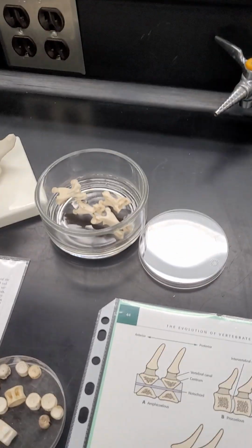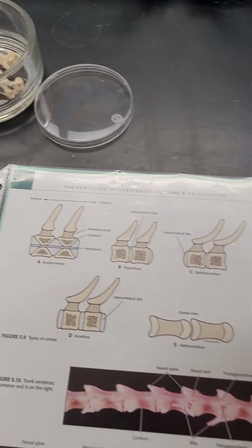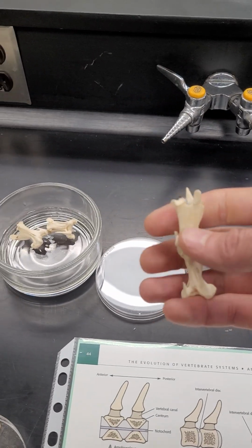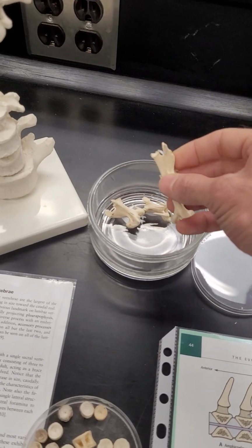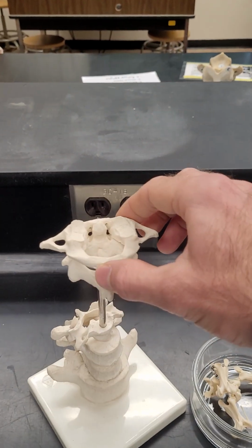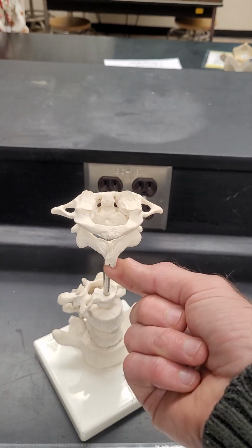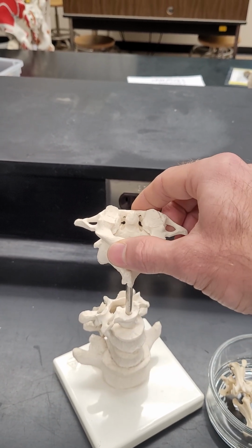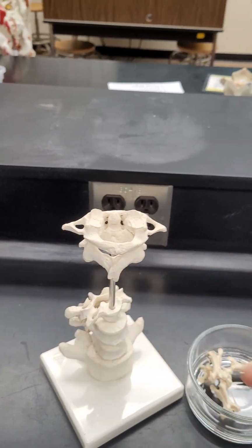And the story here is that we have different types of articulation depending upon the type of movement the animal does. And I particularly want to emphasize the bird vertebrae because these ones are heterocoelous, there's that term, which enables them to bend both left and right and up and down. So it gives them much more mobility. And you can see here, there's an example of an atlas and an axis, which is a special innovation with the atlas evolving in amphibians, so they have some mobility on land, and the axis evolving later in reptiles.